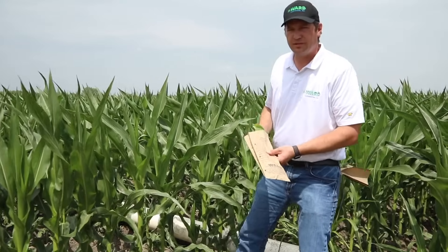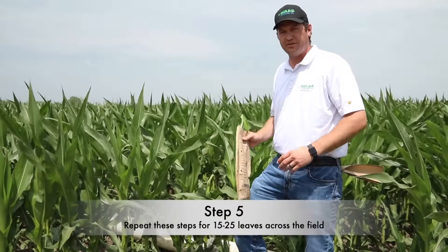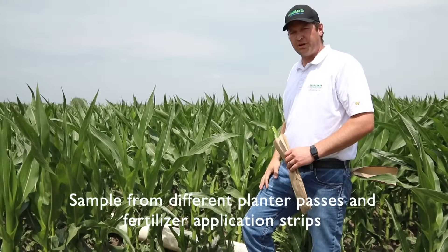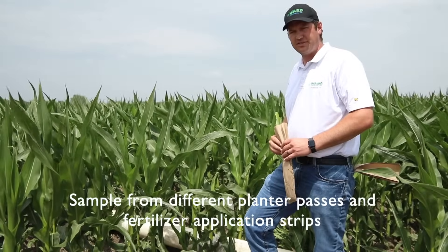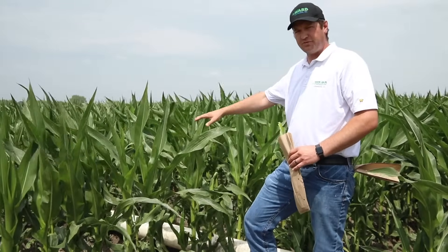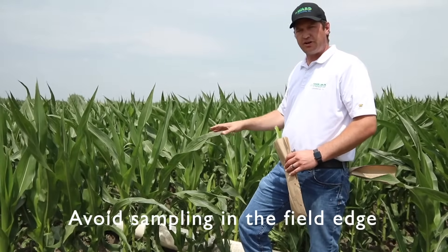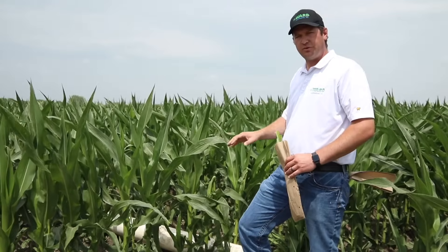For proper sampling, we're going to collect fifteen to twenty-five leaves across the field. As we move, we want to make sure we incorporate different planter passes, different fertilizer application passes. For the purposes of sampling, we want to probably stay away from the edge, so we don't get any starting and stopping of starter fertilizer or shut-off when we're fertilizing the field.